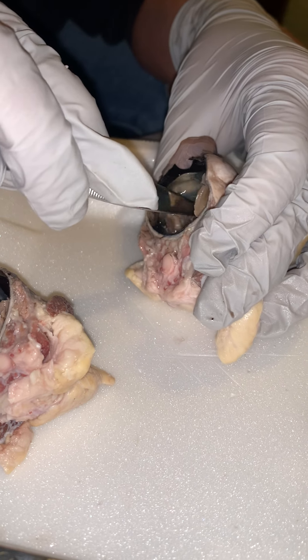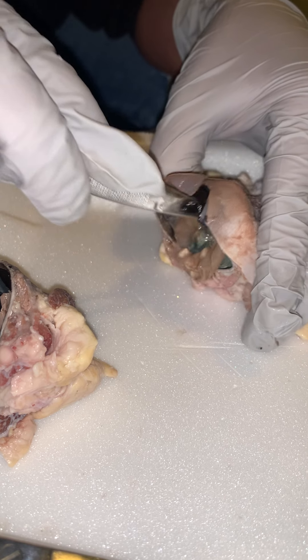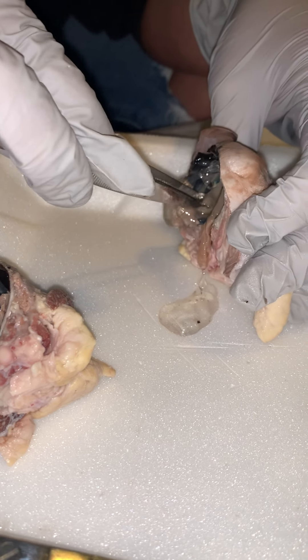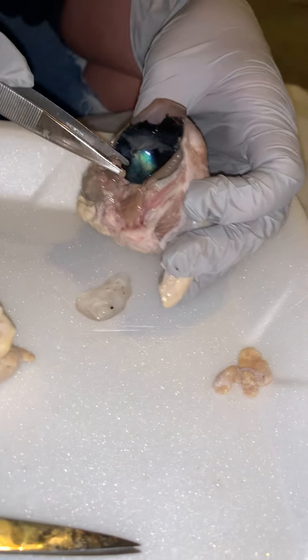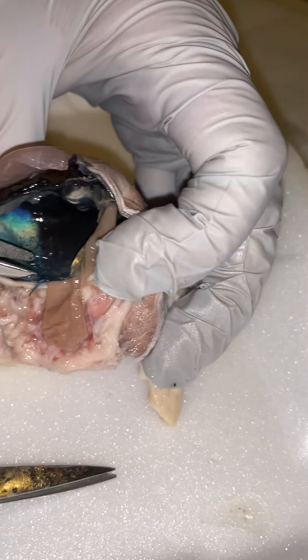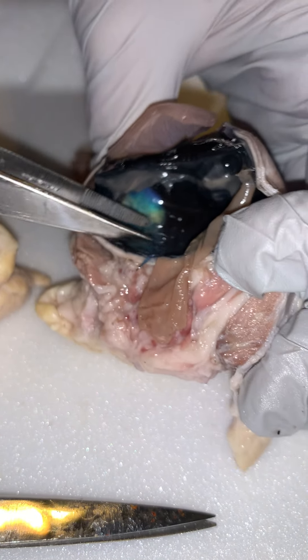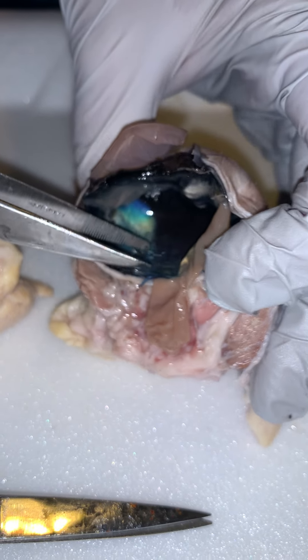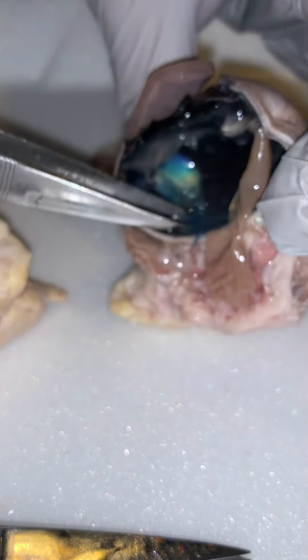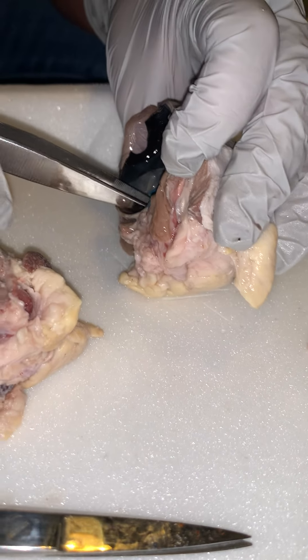If you look in here, there's that really pretty turquoise-y color. That is seen typically in animals, and that is so they have better night vision.